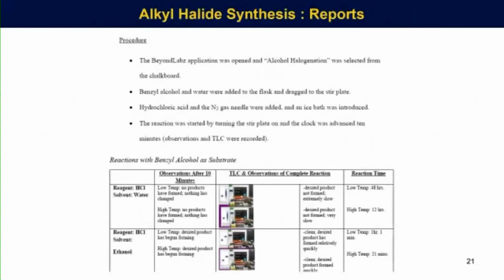Then the students would be writing procedures, third person past tense, all this stuff. This took a while to get them used to because they came from general chemistry, not to put anything against general chemistry, but at our place, they were doing fill-in sheets. They would just hand something in, that was it. Here, we're trying to teach them how to do professional reports. So at the top, we've got the procedure, very nicely done, organized. At the bottom, we've got the evidence, we've got some consideration, we've got screenshots of Beyond Labs as evidence for what they did.